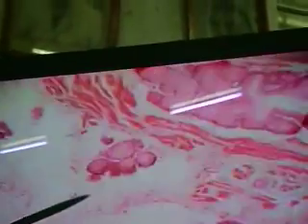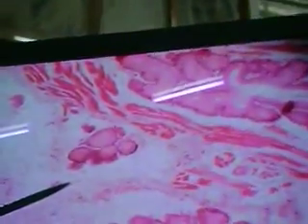Okay? So there we find skeletal muscle going in different directions, and we see outside, or external to it, the tissue that we see outside. The plane of where this is cut is a little confusing, because we're now going on to the area of the palatine tonsil.